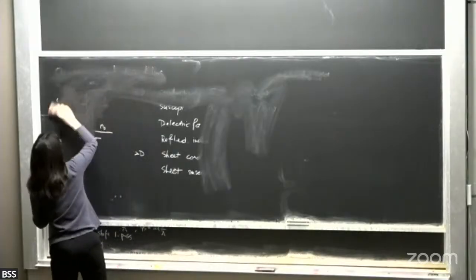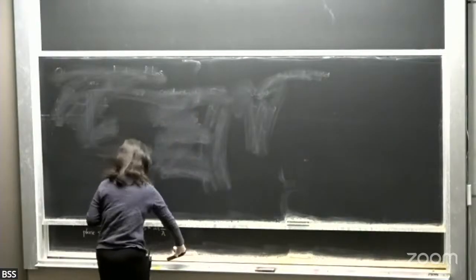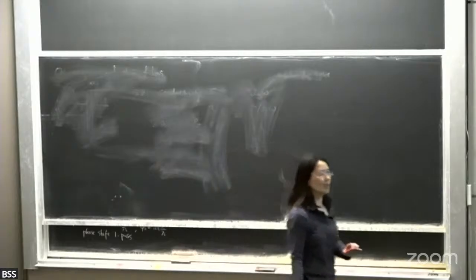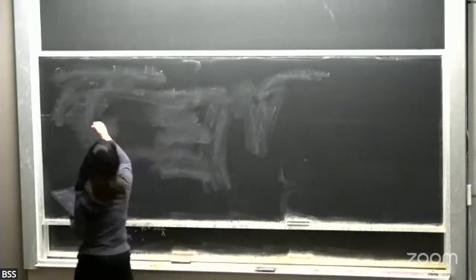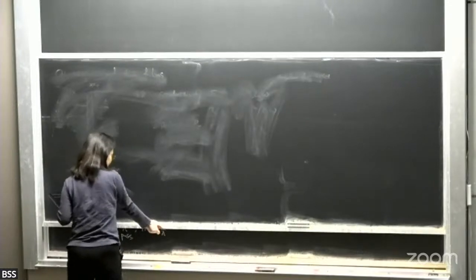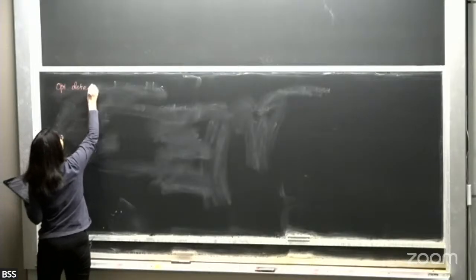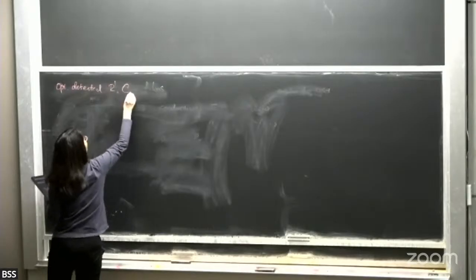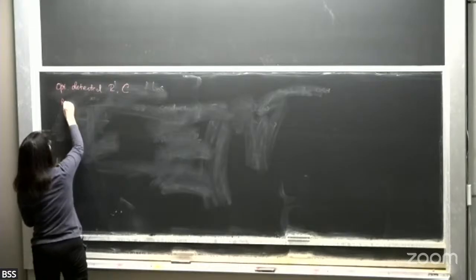interesting and important. So the first technique I want to discuss is this thing called optically detected resistance or capacitance, okay? And the setup actually is relatively straightforward. And this is work from Feng Wang's group.